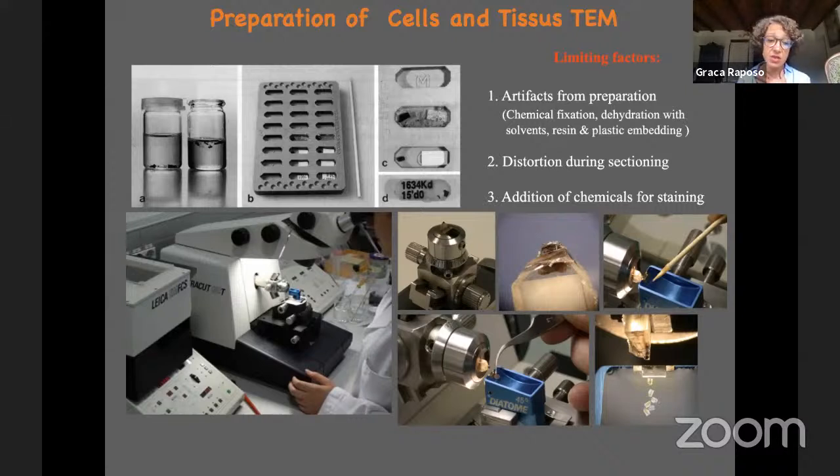But for many years we have been using glass knives that can also be made, and in many labs around the world, I'm sure that glass knives are still pretty much used. The price of a diamond knife like that is almost 3,000 euros. But you can keep it for long when you're careful with it.